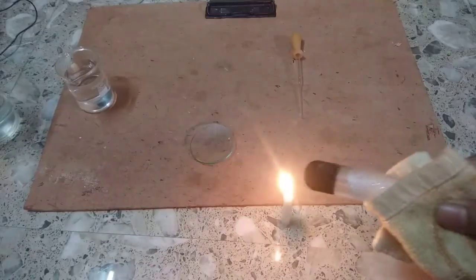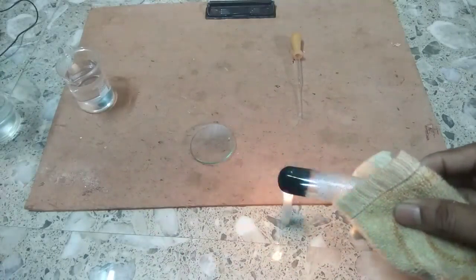On heating the copper sulfate, it loses its water of crystallization. You see in the test tube, droplets of water are there. It loses its water of crystallization, and see what happens.